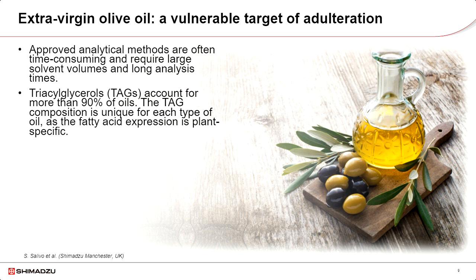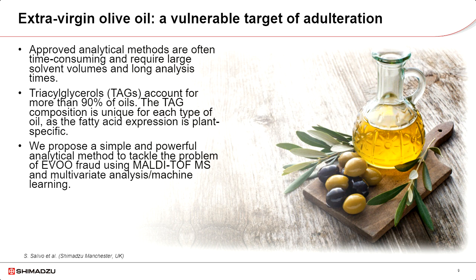Triacylglycerols account for more than 90% of oils. The TAG composition is unique for each type of oil, as the fatty acid expression is plant-specific. In this application, we propose a simple and powerful analytical method to tackle the problem of EVO fraud, using MALDI-TOF MS combined with multivariate analysis and machine learning.